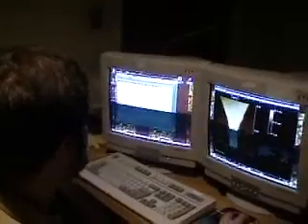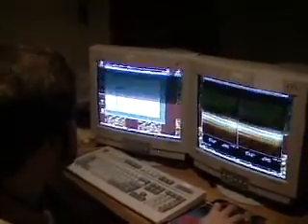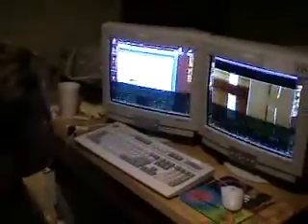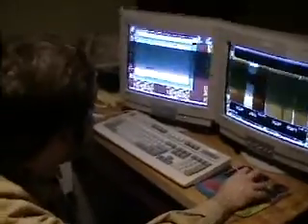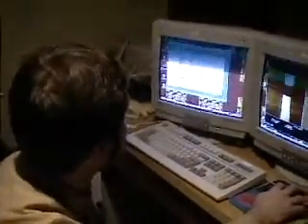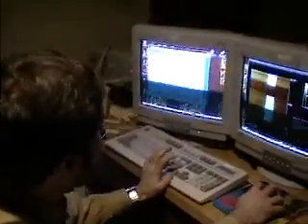Let's look at a different image, and let me show you a different way to do flattening. So here's a different image that I want to use to illustrate one way in which we have control over that flattening or line by line subtraction process. So again, I'm going to do Image, select Left Image, which is the height image.